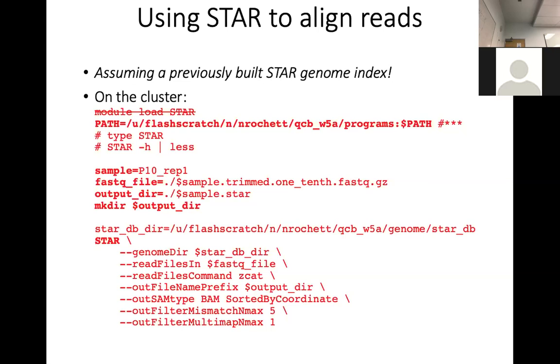If you want to check, you can always see what has changed. Basically the module is essentially what this is.